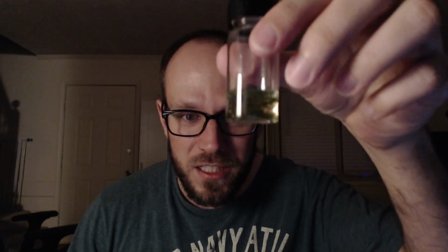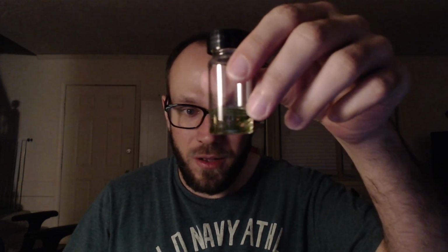This one is my favorite first sample. It's just a bit of moss from my driveway. All of the rotifers you saw earlier came from this sample. They've been living on that slide for over a month, but there are probably thousands more in here right now, which is kind of cool.